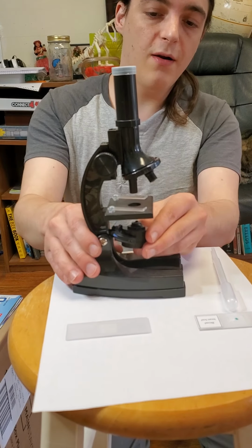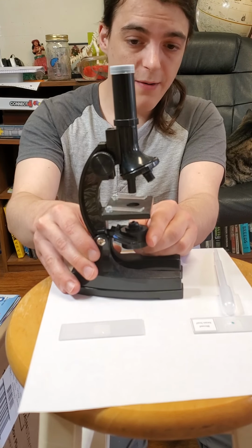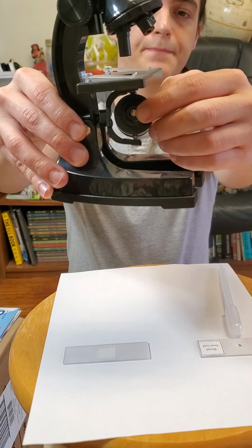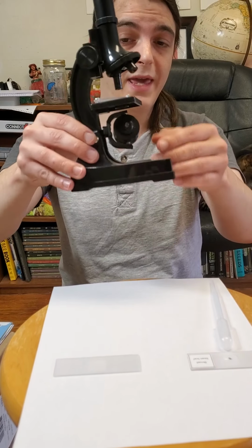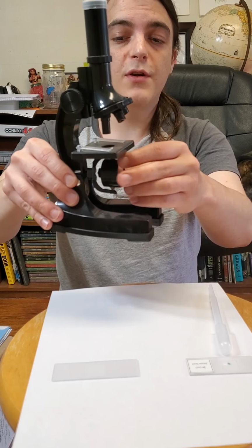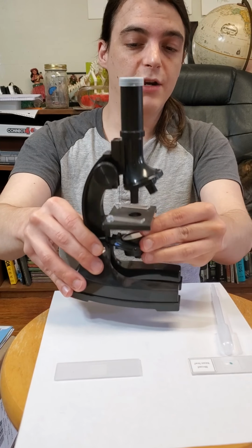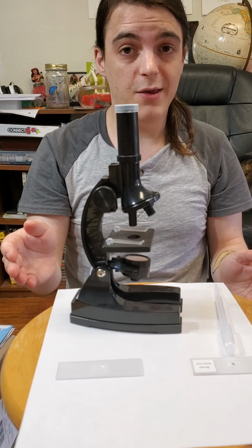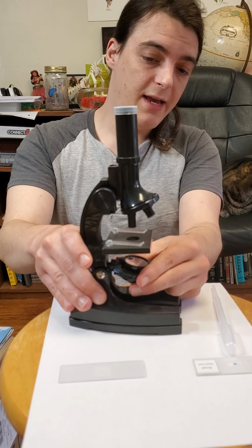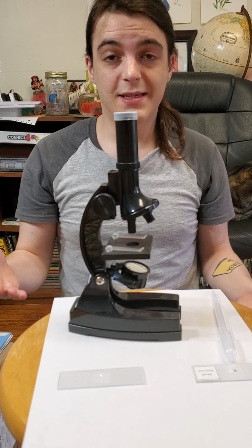Then you've got a very important thing about all microscopes, your light source or illuminator. The part down here, you can see I can turn it around. I've got a little light there because light is very important for a microscope. You can't see something if it's really dark. But most simpler microscopes also have a little mirror so that you can shine light. If you get it just right, it'll bounce off that mirror up into your sample so you can see through it. I didn't know how to use this part of a microscope for the longest time.